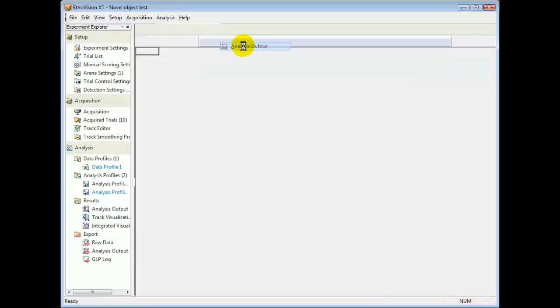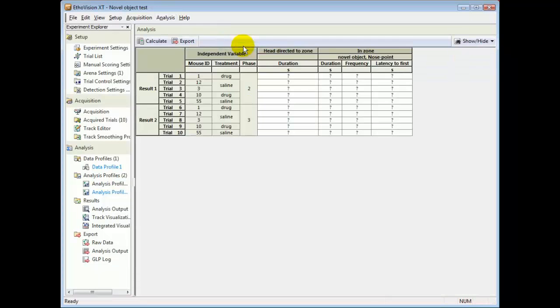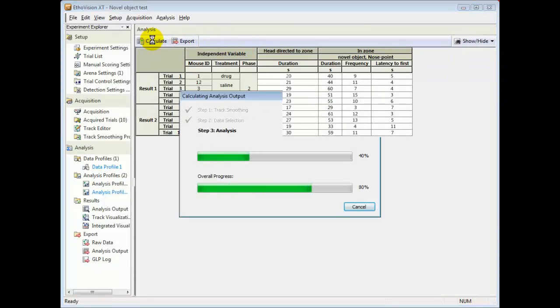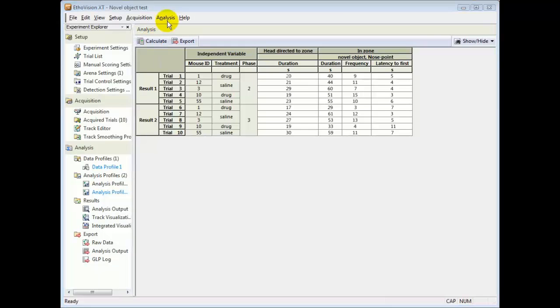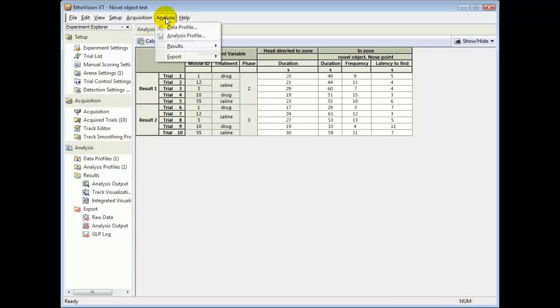Click Calculate. You can copy this table and paste it into a stats program, or you can make an export file.